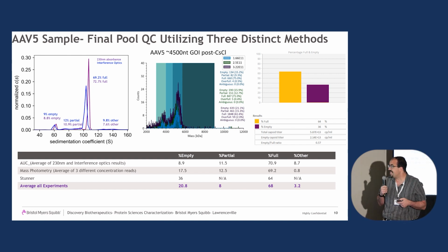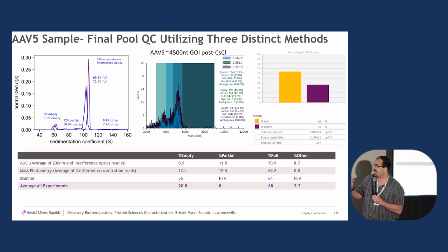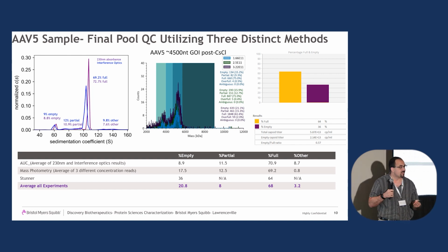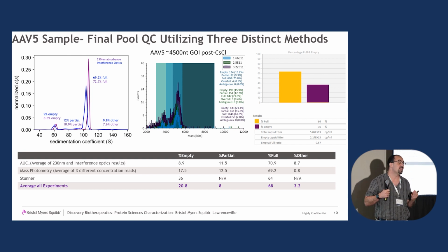That's something that we were kind of dealing with as we go along with our AUC work. One of the things that could be is I'm not really drawing out the overfulls to the larger extent. I don't think that's going to make up for the 8% difference. But I don't know if spinning is playing any role in this, or if we're missing some particles due to the methods of the mass photometer. So unfortunately, I'm not too sure.